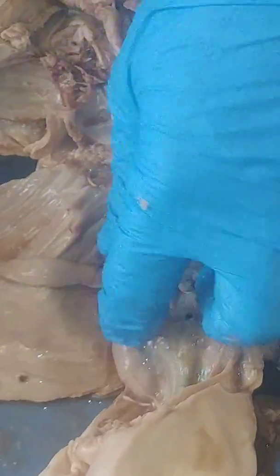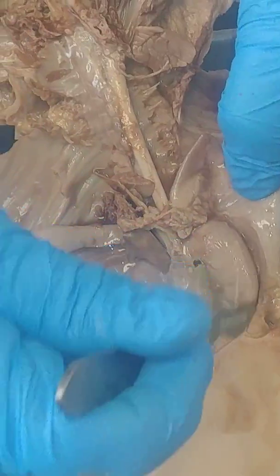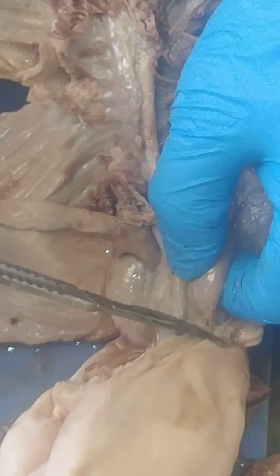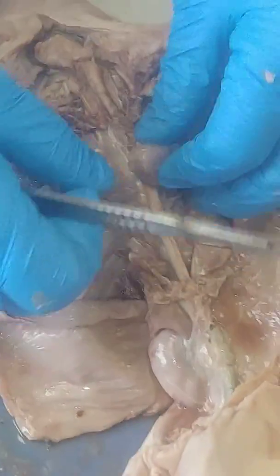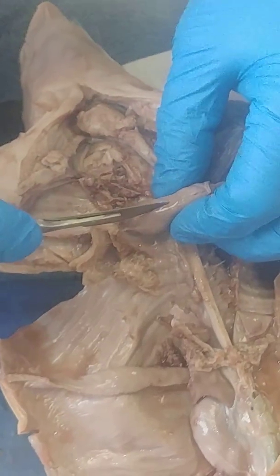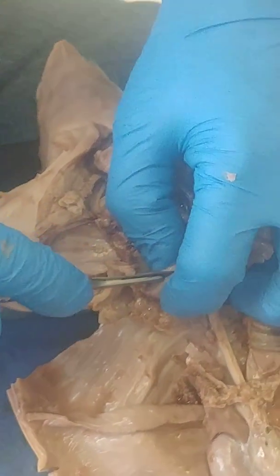Okay, then we get down here, and on each side there's a kidney. Kidney is real important for filtering your blood. The liver does some filtering, but excess water and things like that are filtered out of the body with the kidneys. And we'll take one out of here. And we're going to take a look at the inside. And hopefully we'll get to see some of the different layers here.